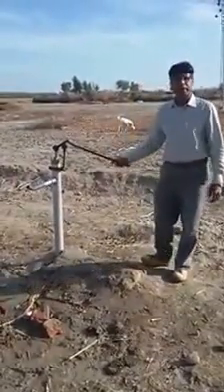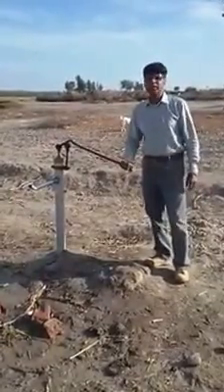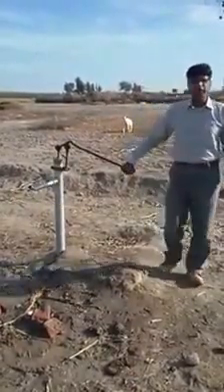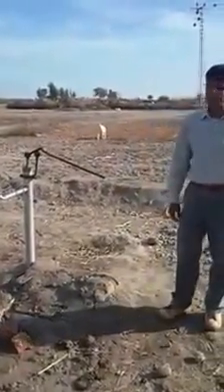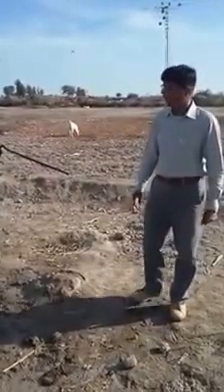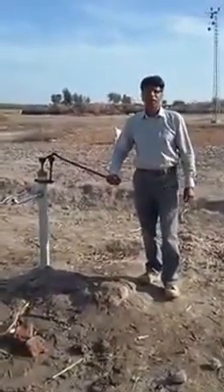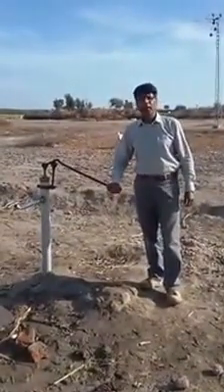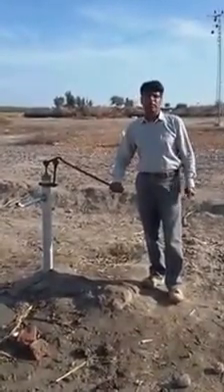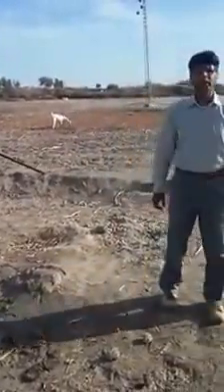This video is about water quality and taste of a hand pump installed for drinking purposes at Grower's Field in Nasarpur. It is very important to note groundwater quality, as reported by the National Water Quality Survey, that most groundwater in the districts of Sindh province, Pakistan is deteriorated and falls below safe values set by WHO, World Health Organization, PSQCA, and the American Public Health Association.